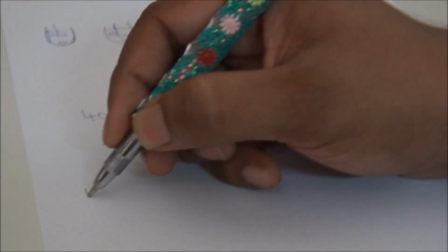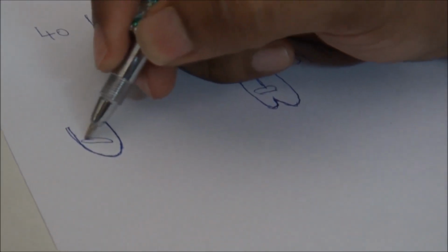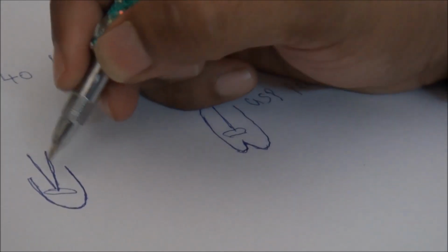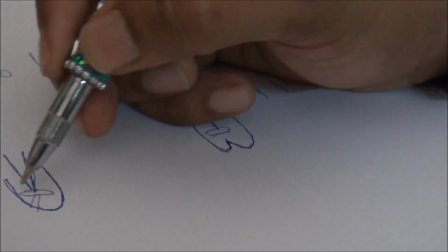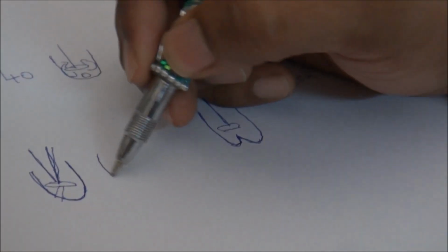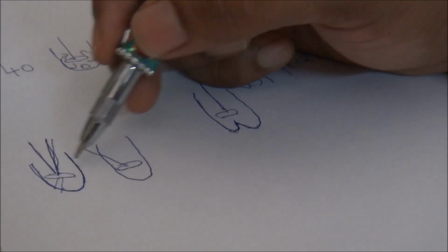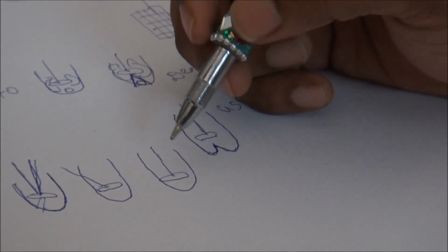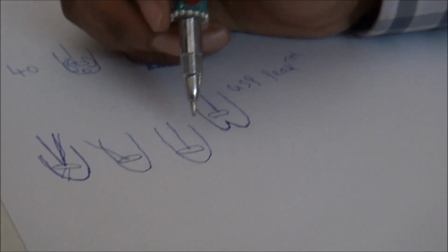To check whether there is coning or not, you can use a tilt paddle technique. In the tilt paddle technique, we are going to tilt the angle of the paddle from 90 degrees. This is a 90-degree paddle. We are going to tilt this angle to 45 degrees, thereby removing the dead volume space here. You can use 45 degrees in either direction and check the dissolution this way. You compare the dissolution of this tilt paddle with a straight paddle, and if the drug release in the tilt paddle is much higher compared to the straight paddle, it indicates that there is a coning effect.